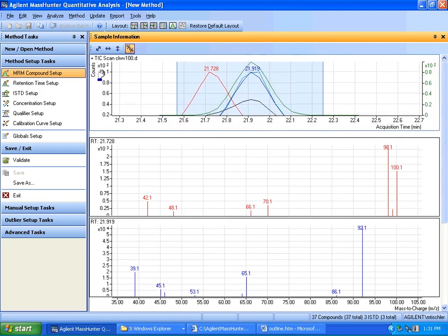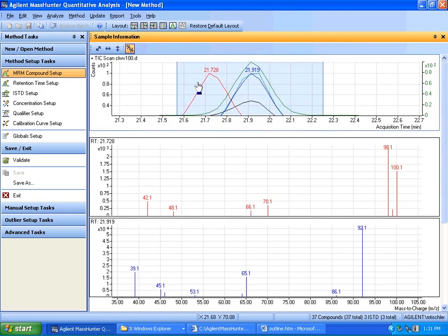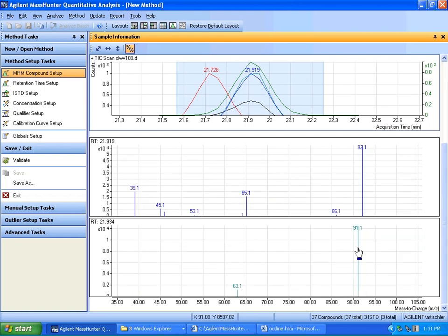And what we see here is that it's found the toluene heavy. Here you can see the difference in terms of molecular weight. And also another compound which it's taken as two different spectra, but I as a chemist am looking at them and they look like they elute very closely together. So here is the spectrum in blue that matches, and there's the one which is in very light green which matches this compound which elutes here.